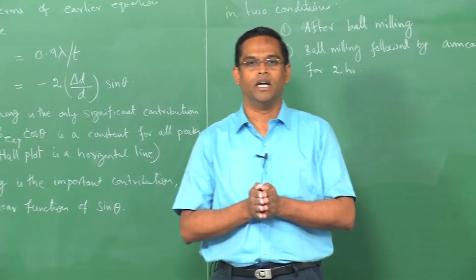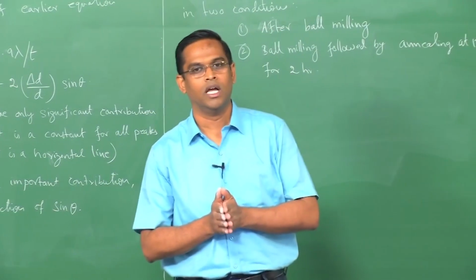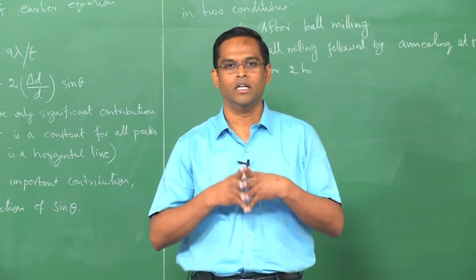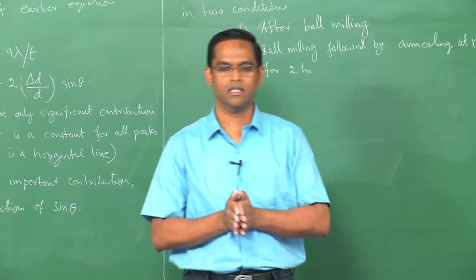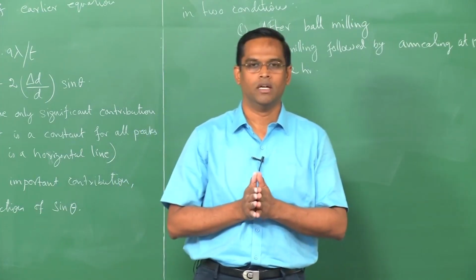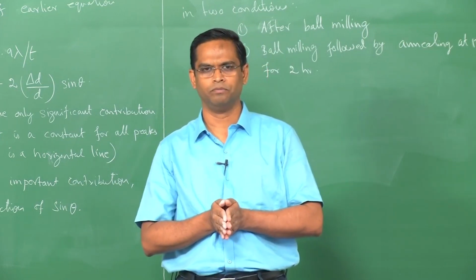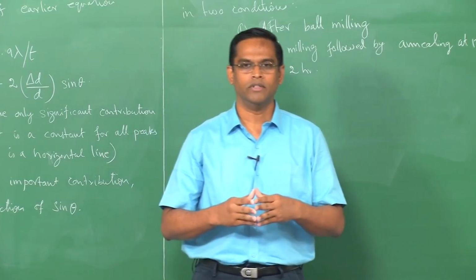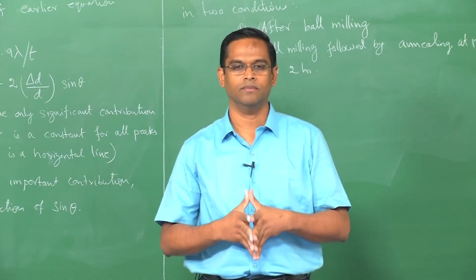And then finally, people use this technique quite often for stress measurements, that is residual stress measurements of all the engineering components. That is one of the vital industrial applications, and X-ray diffraction is also used for crystal orientation determination, namely texture analysis. So, we will touch upon all these applications with small case studies in the coming classes. Thank you.